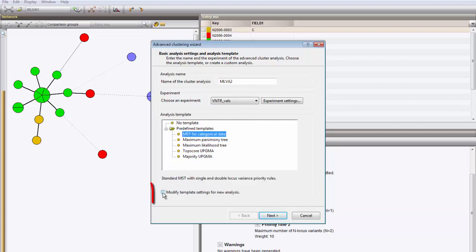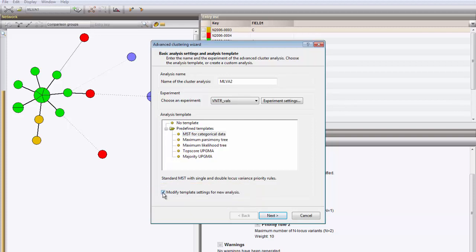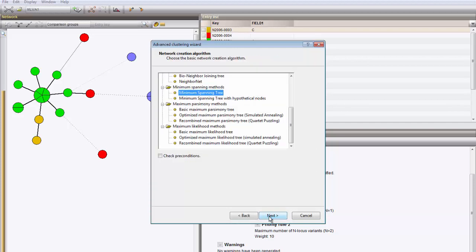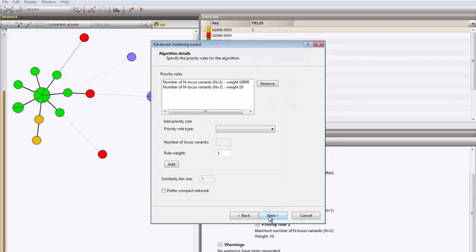And I enable the option to modify the settings for the template. Press Next three times. And this brings you to the part of the wizard where you can remove or add priority rules. I will add a third rule.